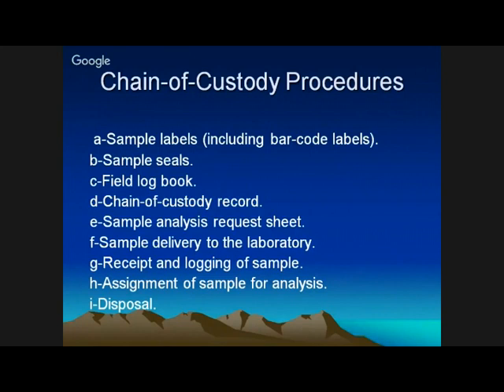In case it is an industrial effluent, there are other parameters you also have to analyze: ions, heavy metals, phenols, pesticides, hydrocarbons. There are so many parameters according to the process of that industry, and accordingly your request sheet should indicate all these parameters.